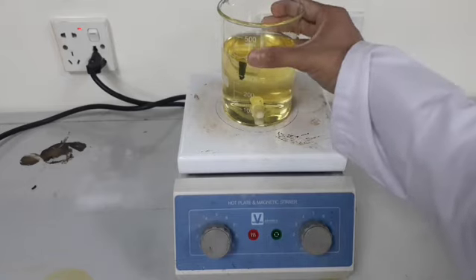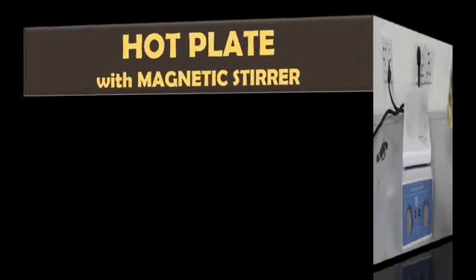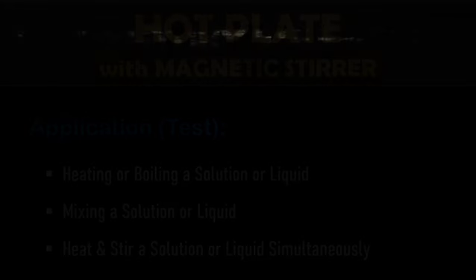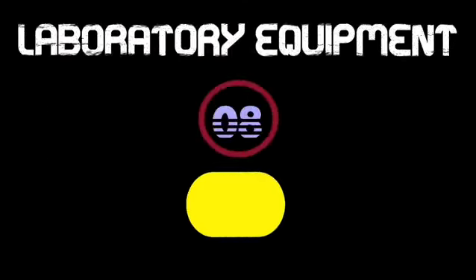The applications are in chemistry and biochemistry labs: heating or boiling a solution or liquid, mixing a solution or liquid, and heating and stirring a solution or liquid simultaneously. And also in pharmaceuticals and microbiology.